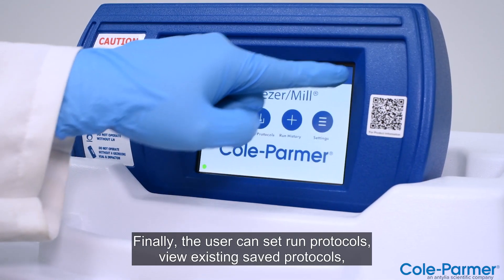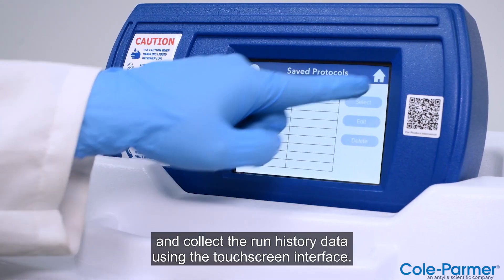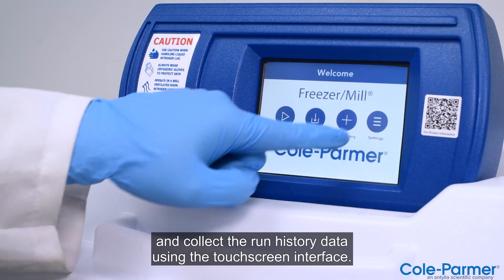Slowly close and latch shut the lid. Finally, the user can set run protocols, view existing saved protocols, and collect the run history data using the touchscreen interface.